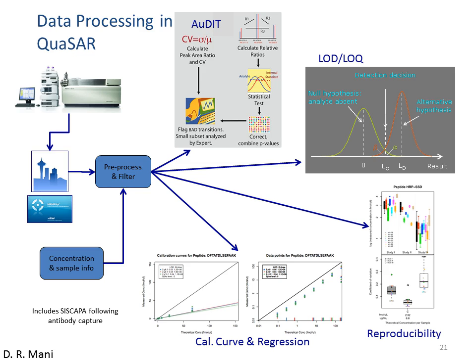But there was always that back and forth. I'm like, no, I just want to press a button. And then I also want to see, can you predict interferences? So I worked with him to get data and to test things to generate this thing called audit, which looks for inaccurate and imprecise and interfered with transitions.